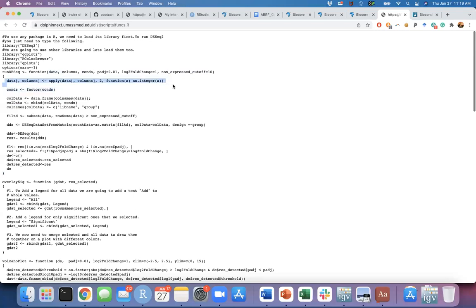In the first row of the function, one more thing: if you want to have a default value of something, this is helpful to identify required data structures for different functions. When you look at the help, you may ask, any tips to understand what kind of data structure a function needs? They tell you with an example in there. For example, the command I'm going to use is DESeqDataSetFromMatrix. This is the function that I'll use.